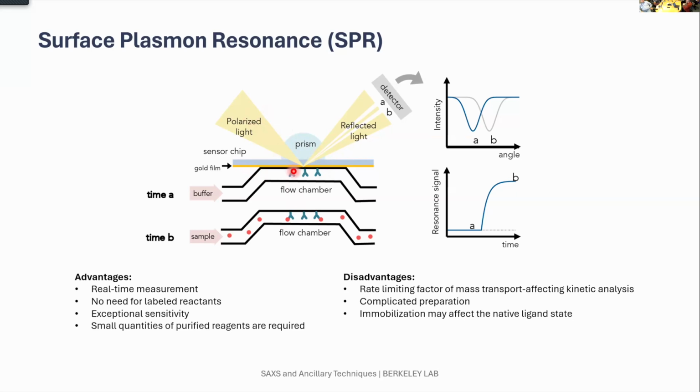Those electrons start to fluctuate, and we have this very sensitive environment of electrons that can change its fluctuation based on anything that flows over that surface. So once we have an interaction, let's say this red molecule attaches to this green antibody-like molecule, we get this dip, and as much as dips form, they are transformed to this kind of exponential signal.